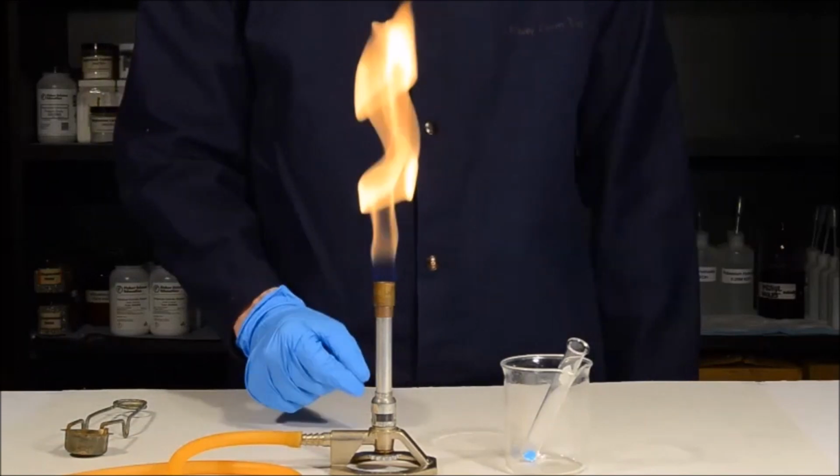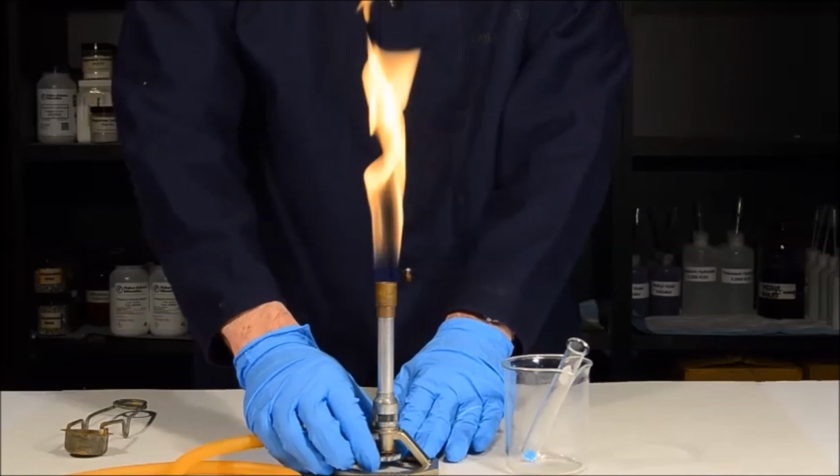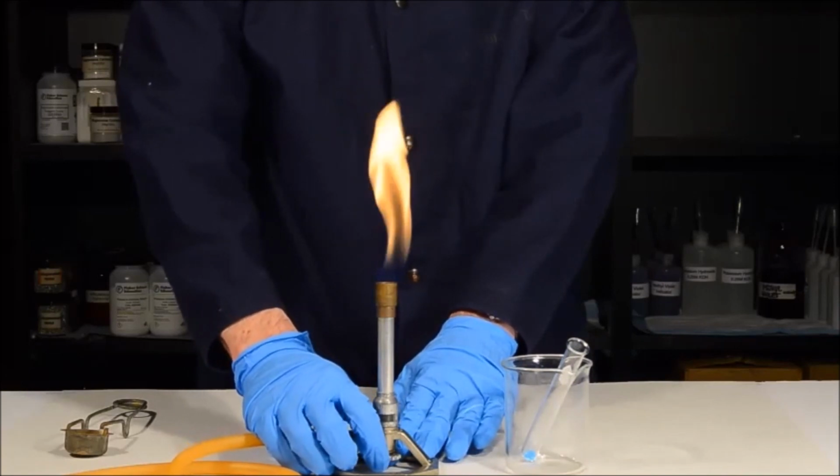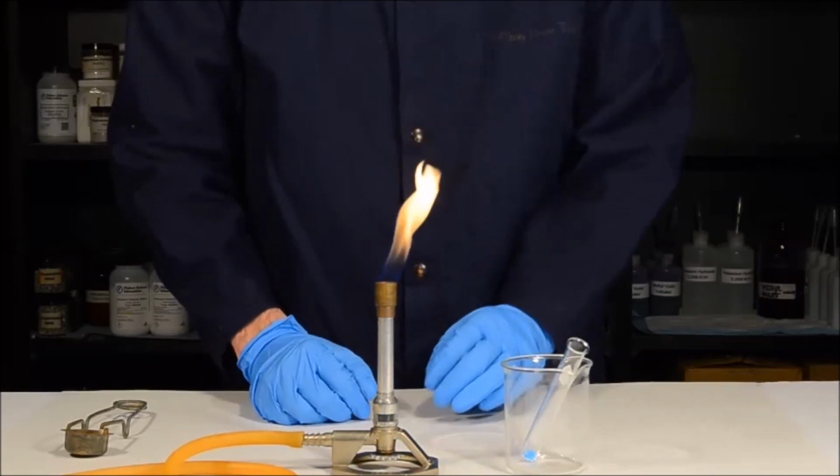Once you have the Bunsen burner lit, you can see here that I have a flame that's too big. Simply dial in the gas nozzle at the bottom of the Bunsen burner until you have a flame that's approximately 6 to 8 inches tall.